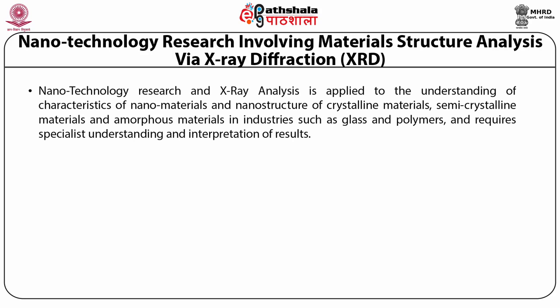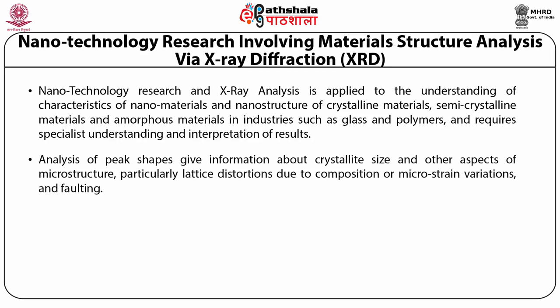Nanotechnology research and X-ray analysis is applied to the understanding of characteristics of nanomaterials and nanostructures for their crystallinity, semicrystalline nature, amorphous character, etc. This is used in industries such as glass and polymer industry and requires specialist understanding for interpretation of results. Analysis of peak shape gives information about crystallite size and other aspects of microstructure, particularly lattice distortions due to the composition or microstrain variation and faulting.